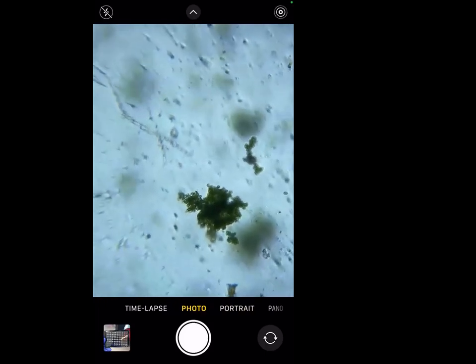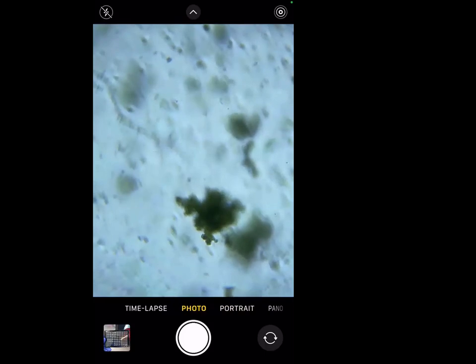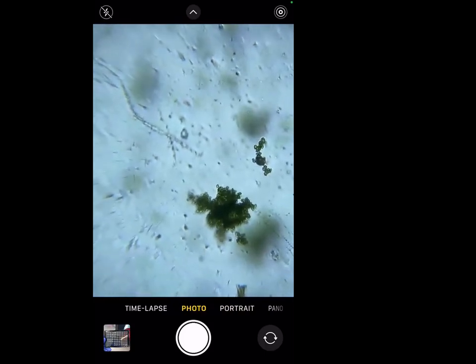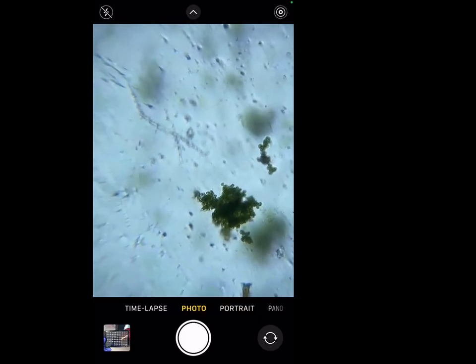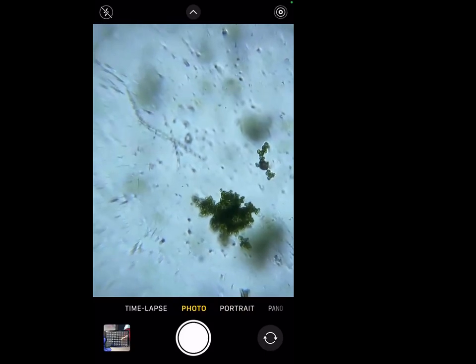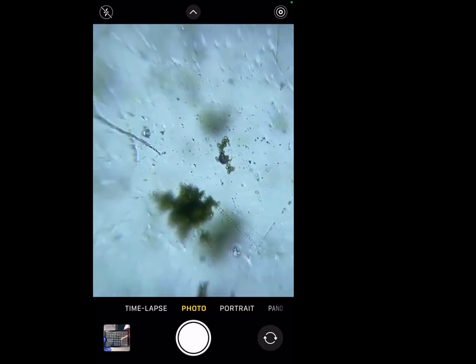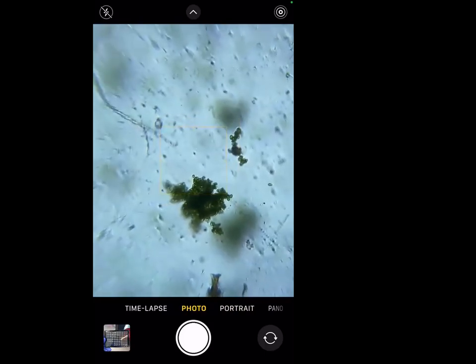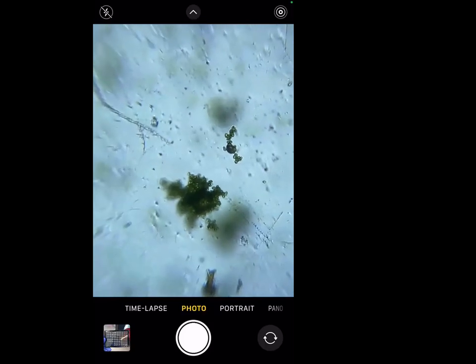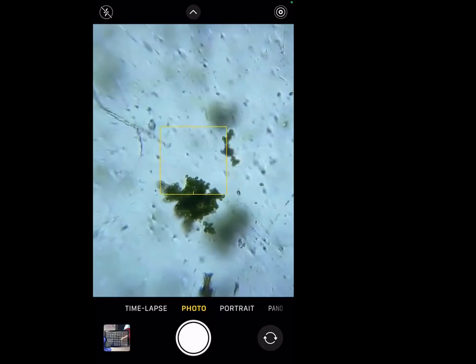So if you have positioned it well, now you can focus in and out and take multiple images. I can take an image at this stage. I can go in further and see it. It's actually more oval in shape. So it's not perfectly circular, it is more oval for sure. And there's a colony there, right? They all are sticking to one another, independent entities, and there's a colony for sure.